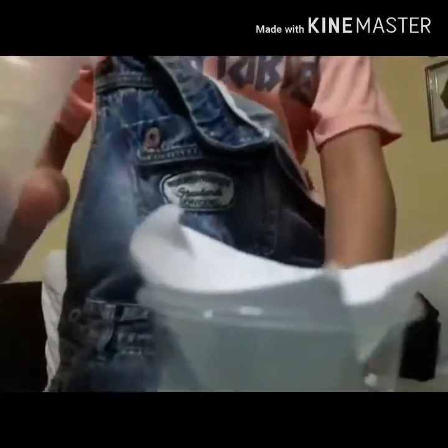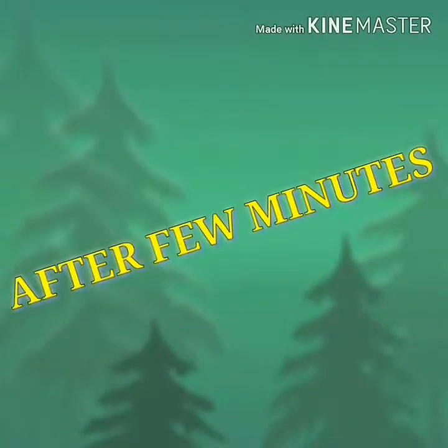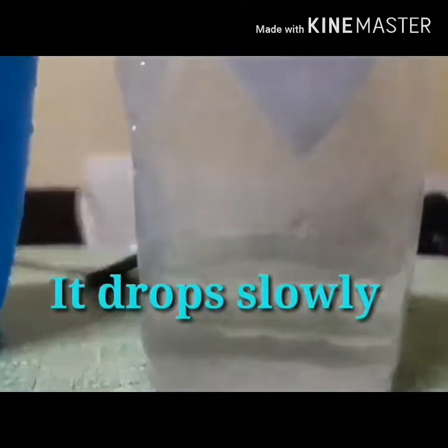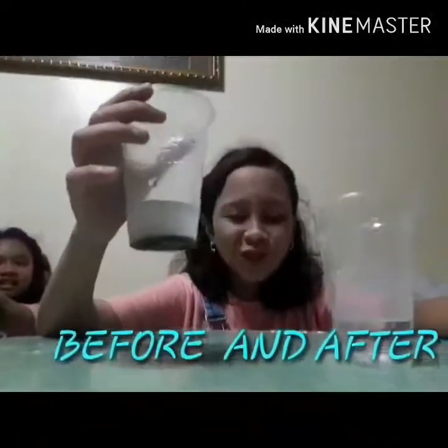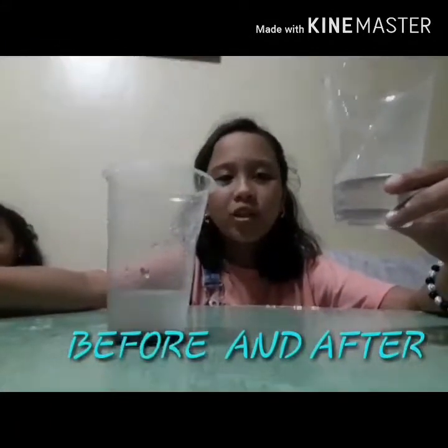Lastly, we're going to pour the mixture one at a time because it drops slowly. Before we did the process, the mixture looked dirty and not safe. After we did the process, the mixture became clearer.